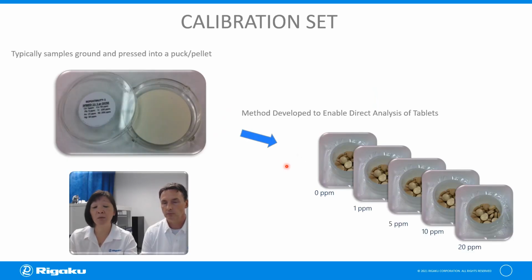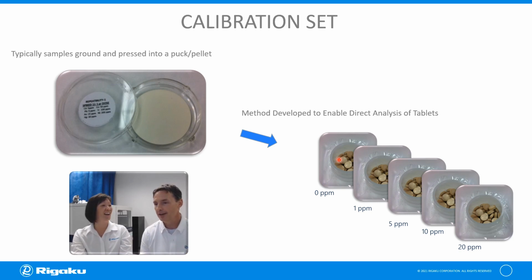Okay, so basically we did the exact same thing as the prep that we showed before, but instead of pressing a pellet, we went ahead and pressed them as little bitty pills. So we actually did this one by one by hand. Because you can imagine, you can do this much more easily if you have a small tablet press. Right. We're cranking them out one by one, which actually shows more variation because we're not applying a constant pressure. We're doing each one individually.